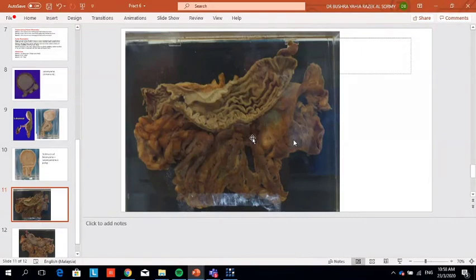Where is the tumor? Here, down or up? The gray whitish area. Where, up or down? Up. Yeah. Can you see this is the tumor? Look at the tumor. Okay, we have to see the wall. Can you see the wall of the stomach? Yes. So what happened here?